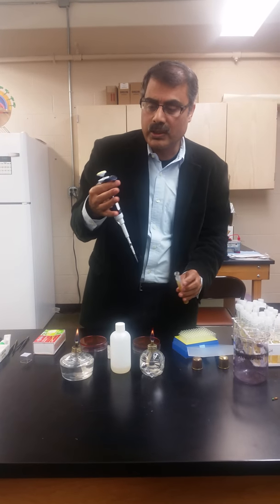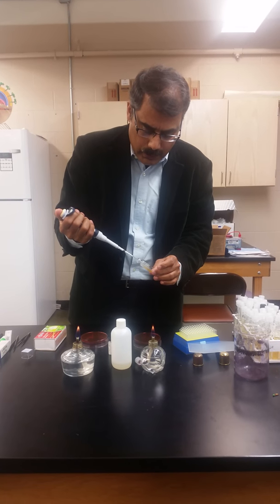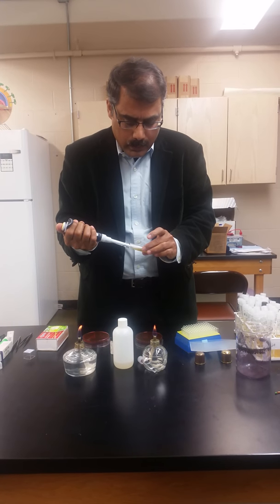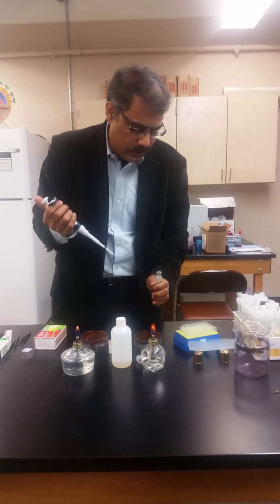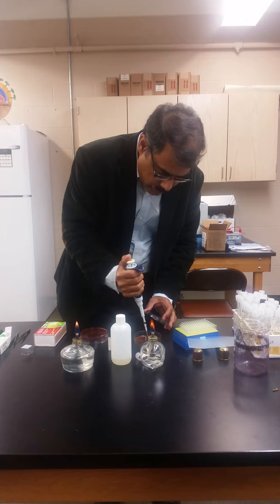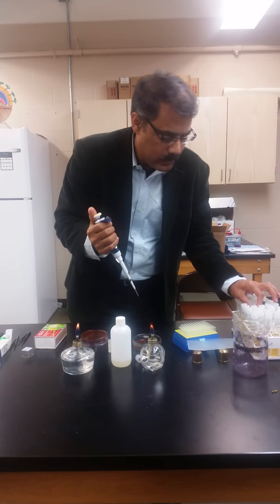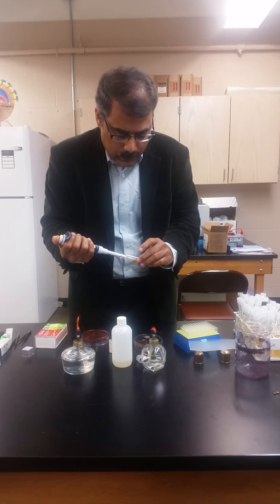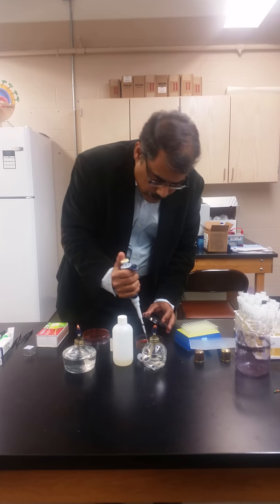with this pipette, which takes out a very small amount. Basically, it's in microliters. I'm going to see if I can go all the way there and collect some of this bacteria. It's a very little amount, about 10 microliters or something like that. Put it in the middle, right there. Take a little bit more, maybe 2 times. So put it in the middle.